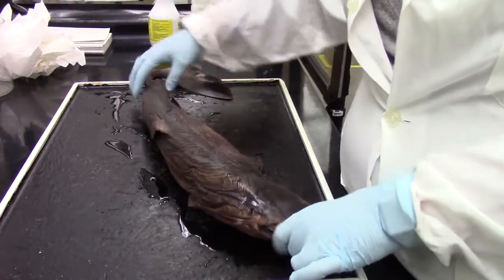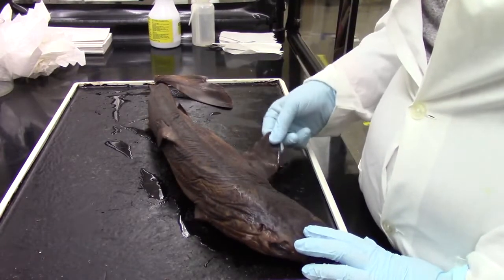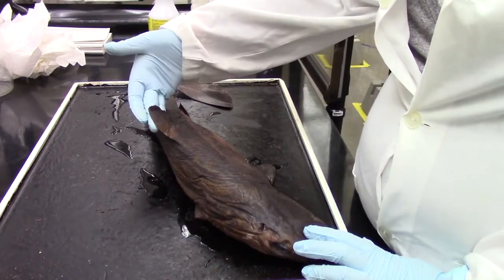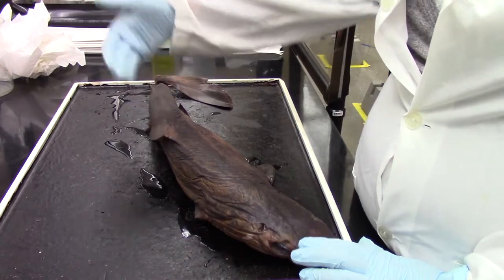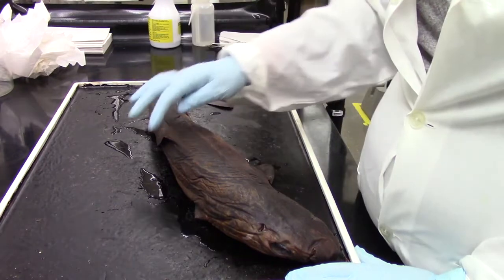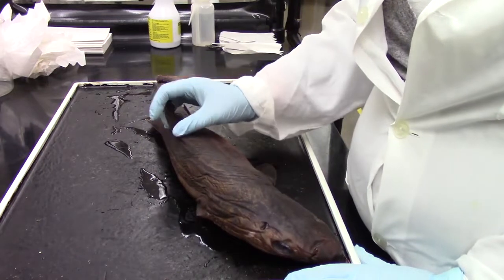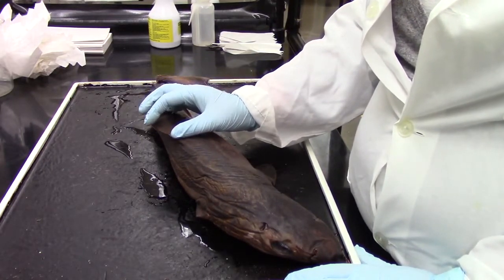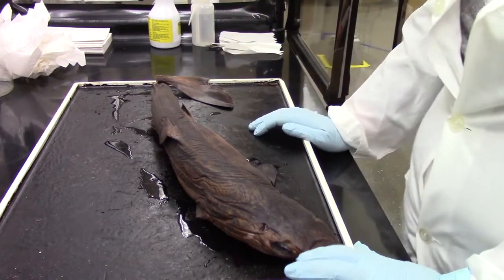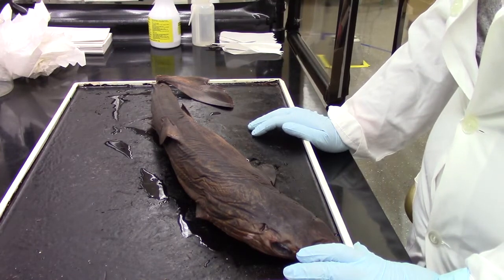If we go back to the dorsal side facing, we can still see our pectoral fins. And then we also have a dorsal fin, so that's our first dorsal fin, and a second dorsal fin back here. These are spiny dogfish, and normally they would actually have quite a large spine projecting off of each of their dorsal fins. Those are a little bit hazardous actually, so those have actually been removed from these dissection specimens.